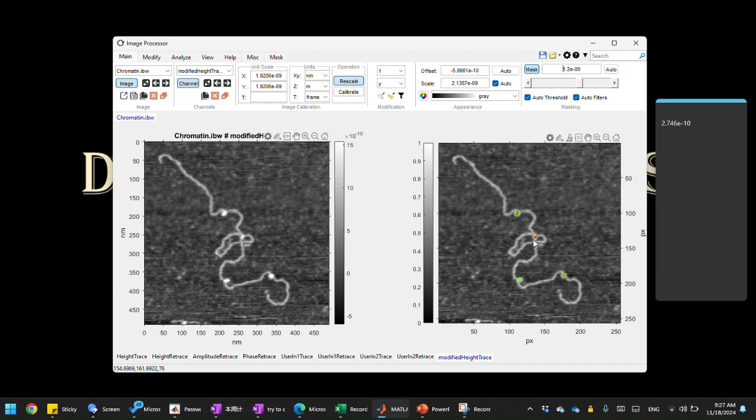And sometimes we still have a bit of the DNA, like here, that's masked. In this case, we can specify an even higher threshold so that only the proteins are masked. Let's give it an even higher one. So there you go. We have the proteins masked, but the DNAs are not, right?